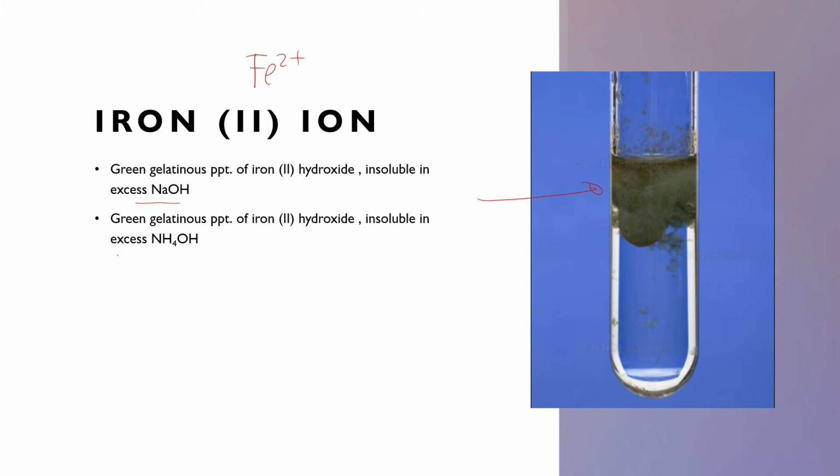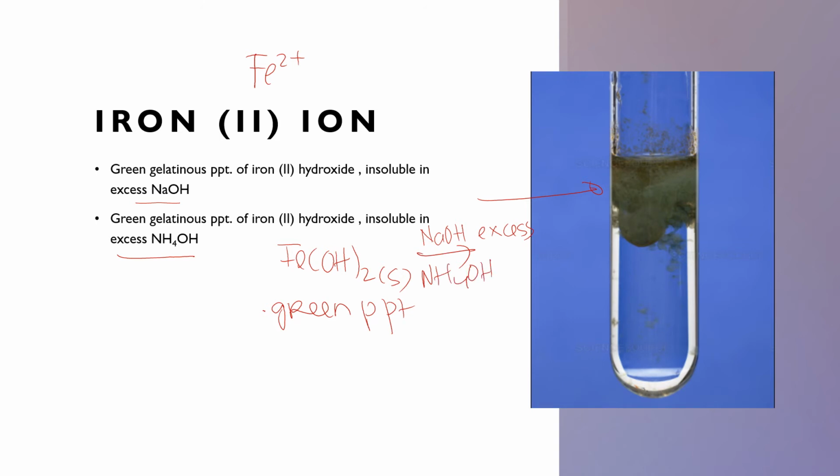Also, in excess NH4OH, the Fe(OH)2 precipitate, this is green PPT, with both excess NaOH and excess NH4OH, the precipitate will not dissolve.